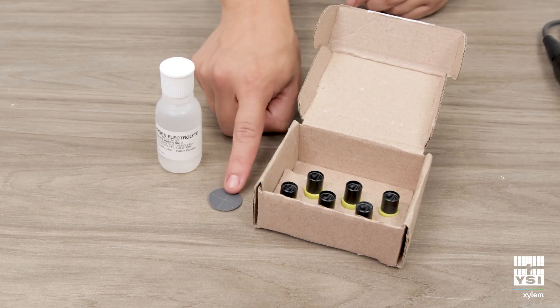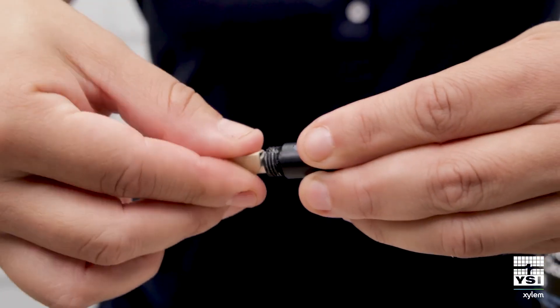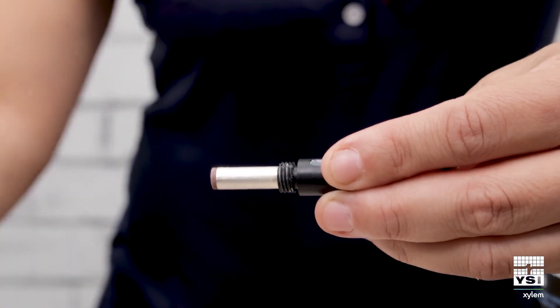The provided sanding disc can be used to remove deposits from the anode and cathode before replacing the membrane cap. After sanding, be sure to rinse the sensor tip with distilled or DI water.